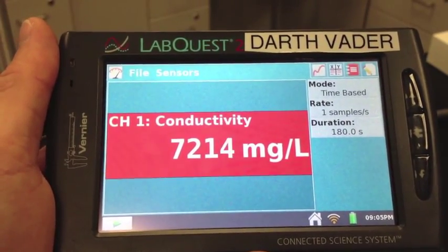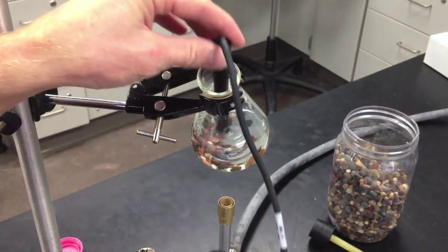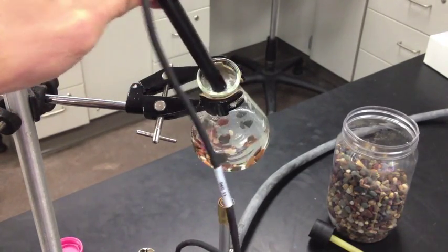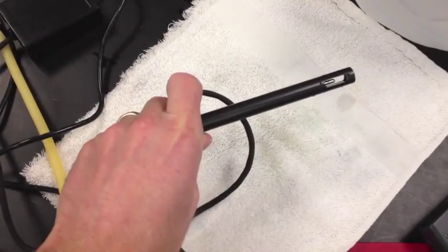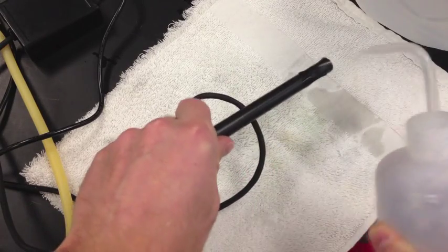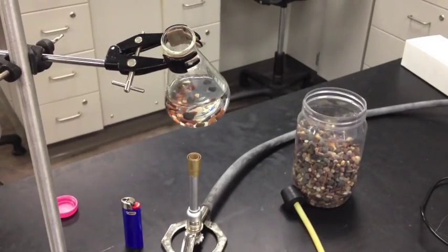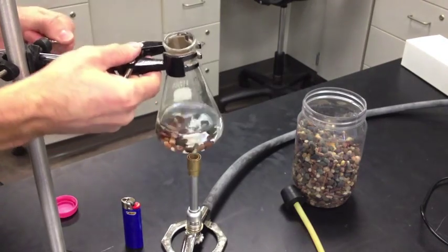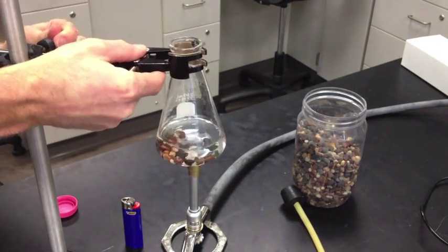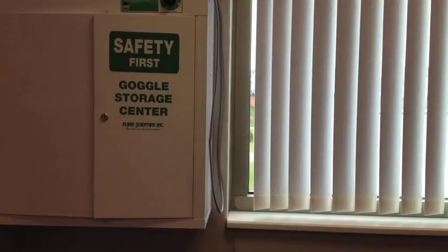You do not need to connect your iPad to the LabQuest for this experiment. Carefully remove the conductivity probe from the saltwater, and over a towel, rinse the saltwater off using distilled water. Set the LabQuest aside — you won't need it until you've completed the experiment. Reset your Erlenmeyer flask and put the cover back on. Put on your goggles.